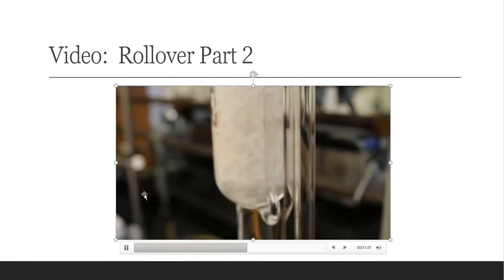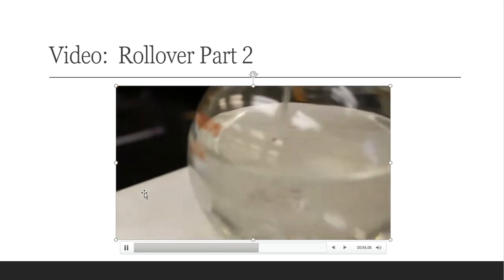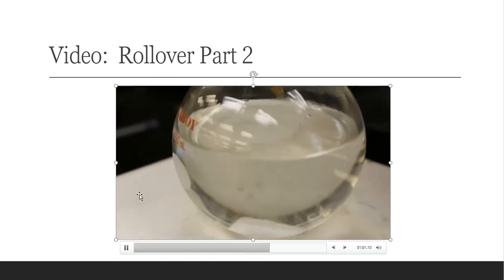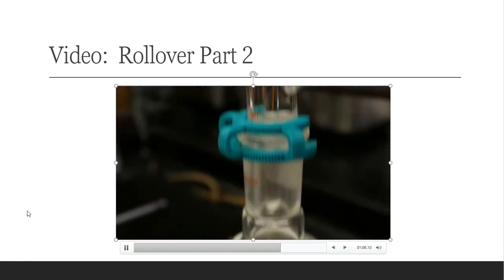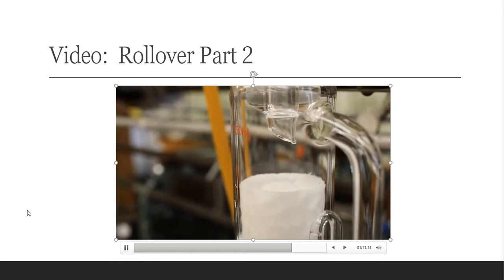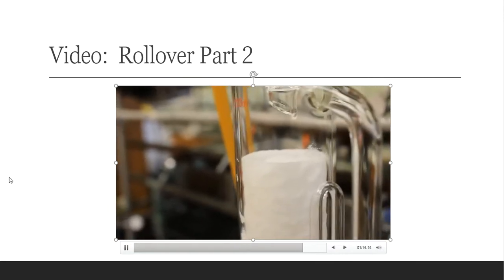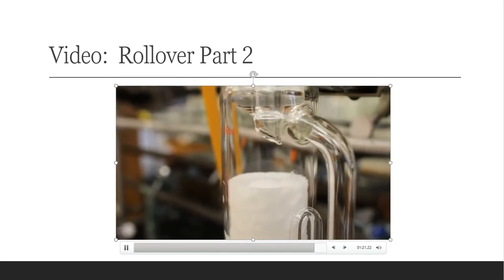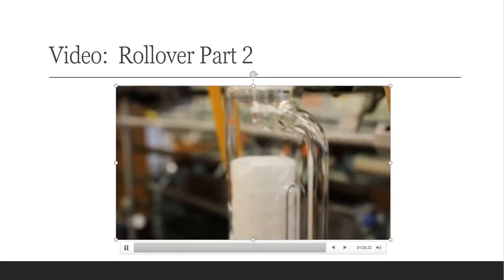And folks, there it goes. There's the drain that's beginning to happen. All of that liquid is getting dumped back down into my flask that sits below. And now that ether is continuing to get heated, and fresh petroleum ether is making its way back up into the Soxhlet thimble area. I'm going to continue this process over and over. I'm going to document the time that each rollover happened, and keep track of about four or five of these to see if it's too long or too short. So that is what we mean by a rollover in the Soxhlet.